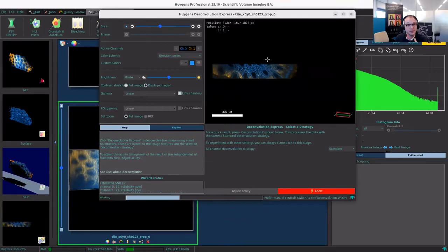Yeah, so this makes it faster. It's very good that even if your data doesn't fit entirely in the RAM of the GPU, it tries to make it into smaller bits that do fit on the GPU and then calculates it bit by bit with an accelerated speed. So that makes it very nimble as well.